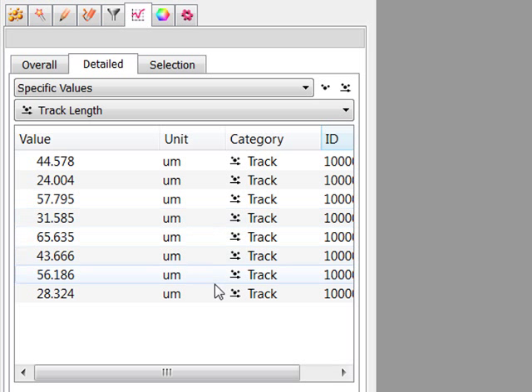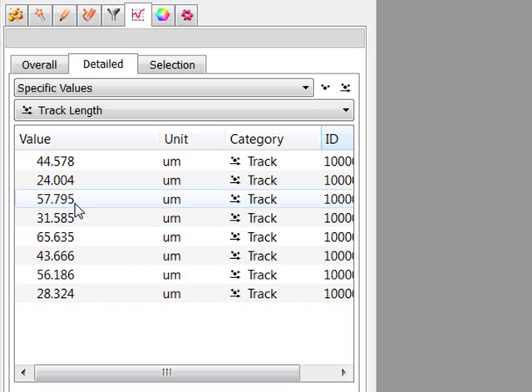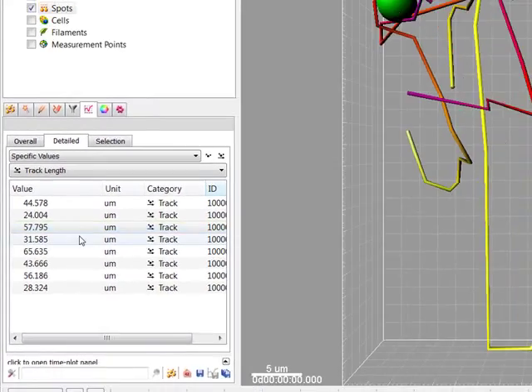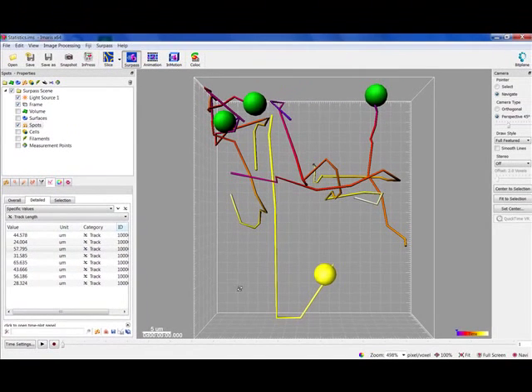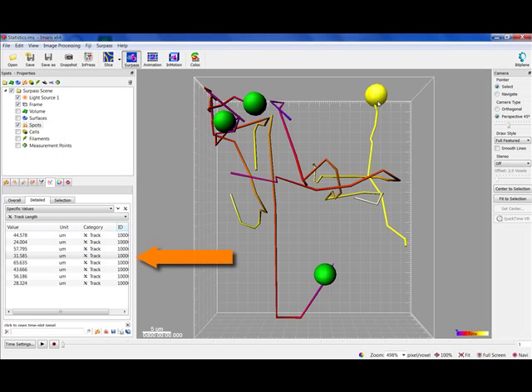The Specific values table also provides interactive two-way selection. A click on an individual row of the table highlights the corresponding object in the image. Similarly, by clicking on an object within the image while the pointer is in Select mode, the corresponding statistical value is highlighted.